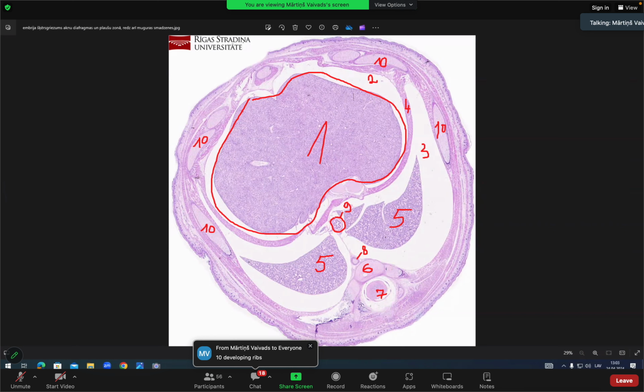In general, we can continue with this on and on. There's skeletal muscle tissue, there's skin development, epidermis, dermis, hair follicles, that continues on and on. So if you get these rat slides, there's quite a lot of detail you can go into.